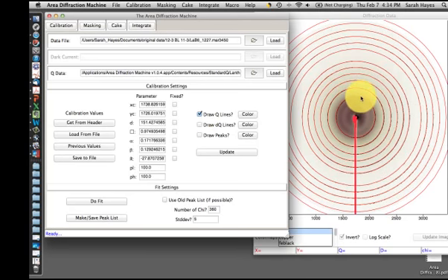And you can see that this actually fits quite well. The peaks are definitely well represented here. What it thinks are the peaks are drawn in red, and what you know to be the peaks are what's in black in the pattern.